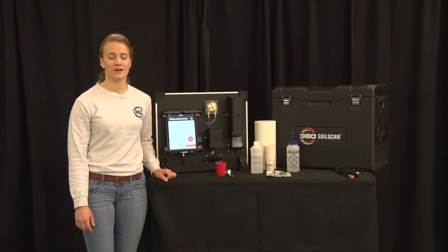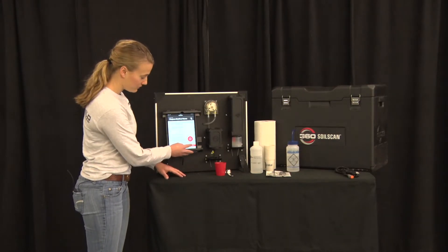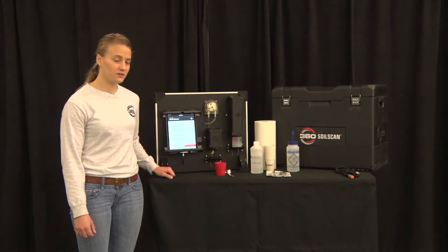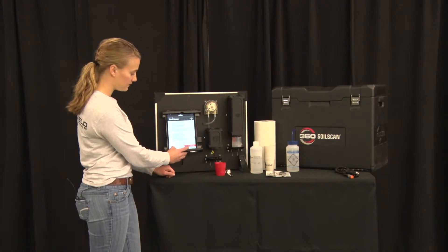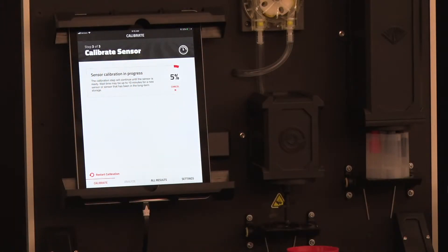The soil scan app provides step-by-step instructions — simply follow the on-screen prompts. After purging the water we are soaking our sensors, so select Soak Sensors. When the sensors have soaked at least 15 to 20 minutes you can start the calibration by selecting Next Step: Calibrate Sensor. When calibrating, ensure that the sensors are always in the nitrate solution. This calibration process must be done at least every 24 hours.